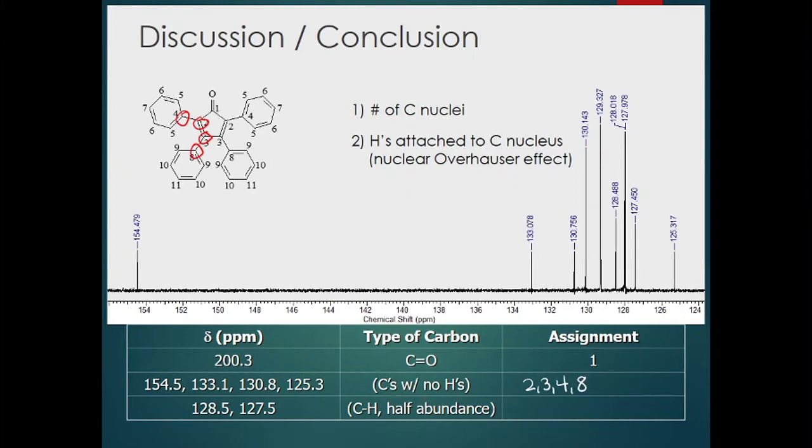We don't know specifically which peak is carbon 2 and which peak is carbon 3, but we don't need to make those specific ones. We do have more information at this point that our putative structure is matching our data that we have so far.